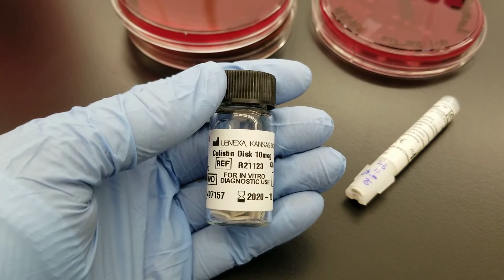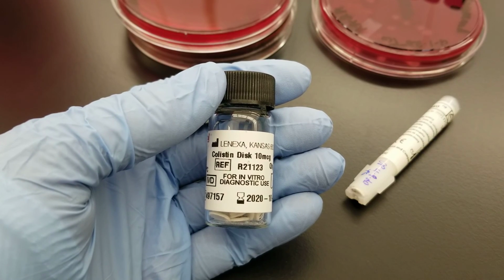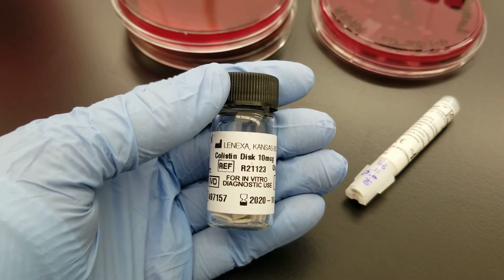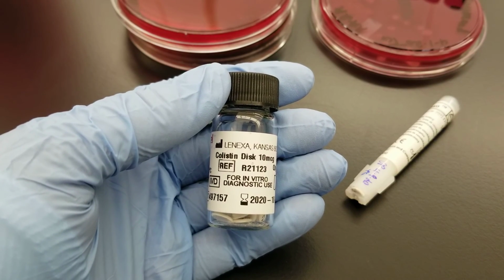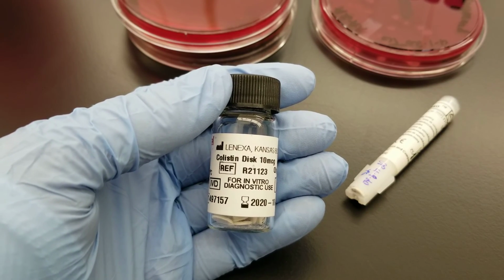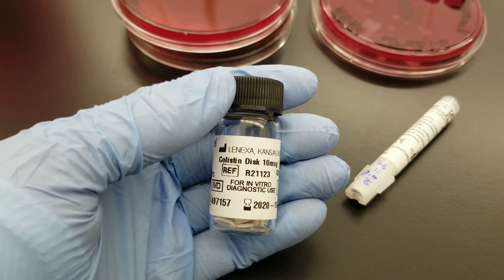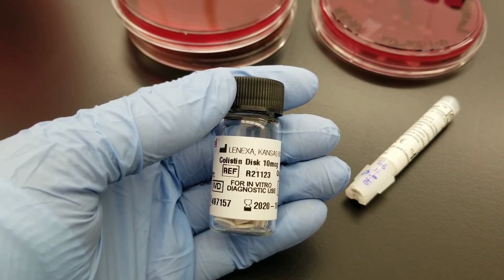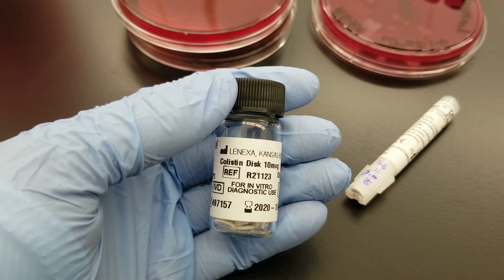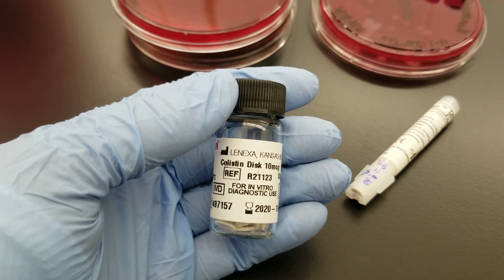Those are just to help categorize what group of anaerobe it is. You would want to look at the growth around the discs, and at the gram stains, to help group those organisms. Most of the anaerobes in these specimens are going to respond to those frontline antibiotics that the patient would naturally get, depending on what facultative anaerobe is the causative agent of the disease, if that is the case.